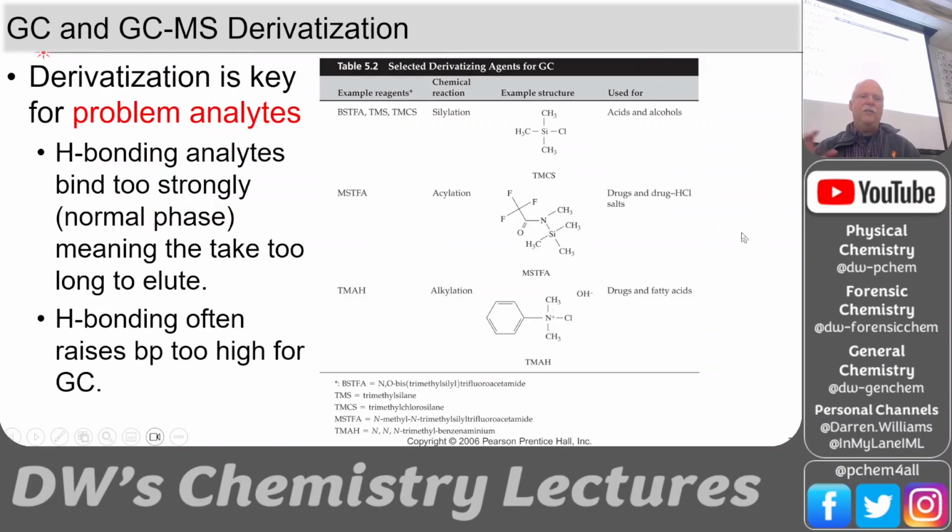All right, lastly, let's switch gears and go back over to chromatography. We talked a little bit about that last time. And in the instrumental class, I'm not sure they talk much about derivatization. So this is a key piece of the puzzle for problem analytes, and in particular acids.